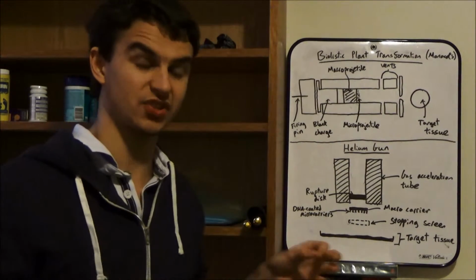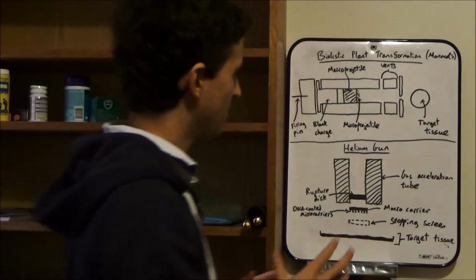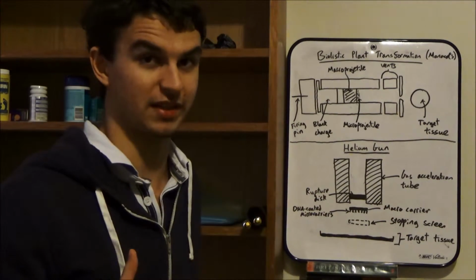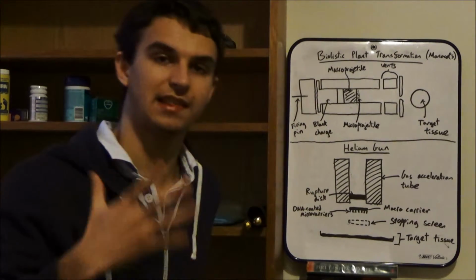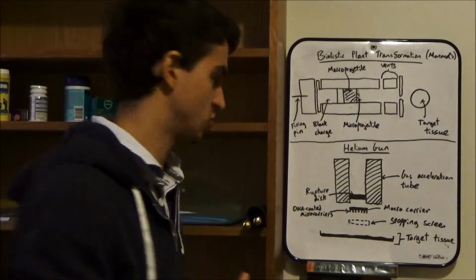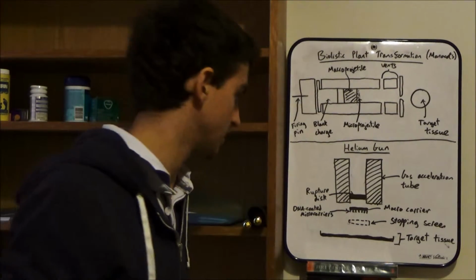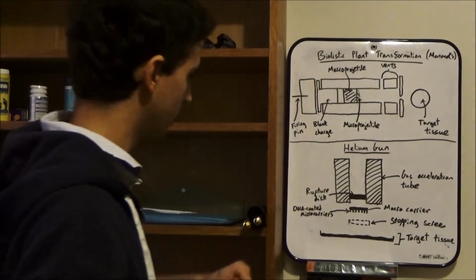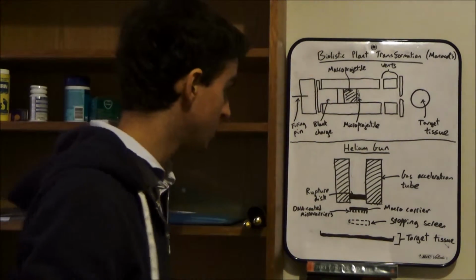Now, it wasn't actually commercialised, and the reason why it wasn't commercialised was because it's a little bit inefficient. The Avon and Somerset Constabulary class it as a gun. So you actually need a licence to have one of these things. So what was actually commercialised is this helium gun here, which is a lot more family friendly, I've got to say. What it contains is this gas chamber, this gas acceleration tube, full with helium.